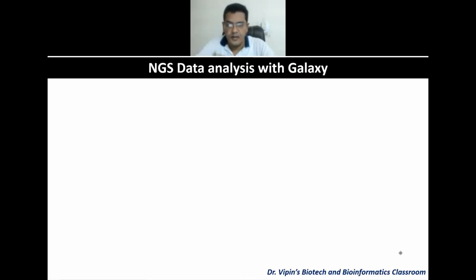Excuse me, sir. Sir, I was able to run the NanoPlot actually. I got 8 plots for one data, and the 16 plot only I got. After that, I was not able to proceed actually. The log and all was there. Sorry? Only those 8 plots. After that, I was not able to continue due to some error.